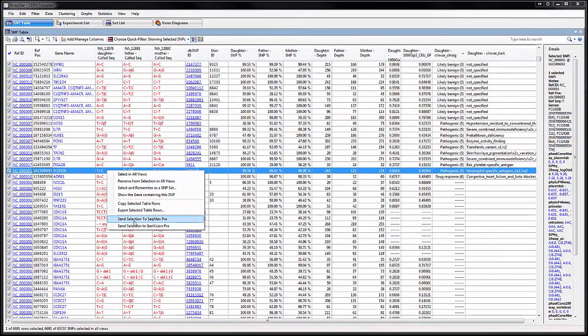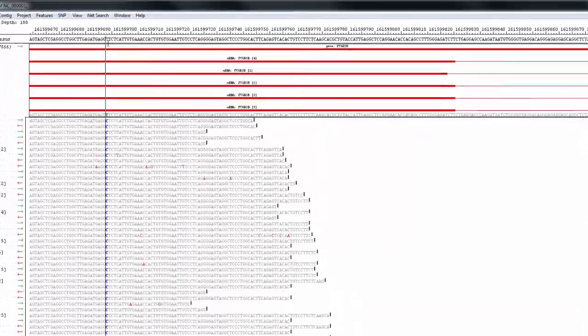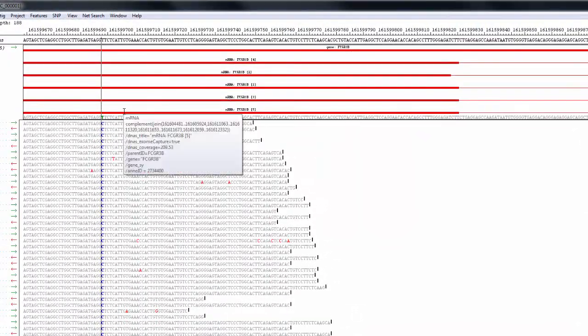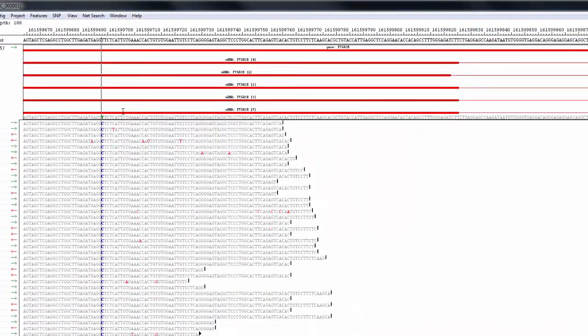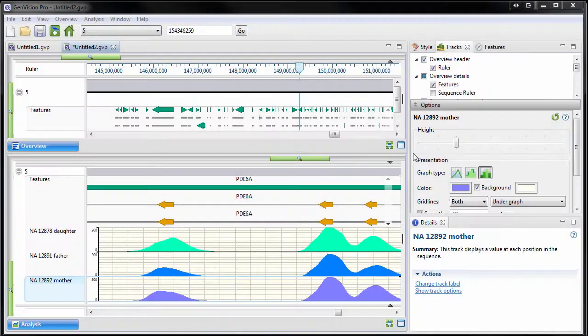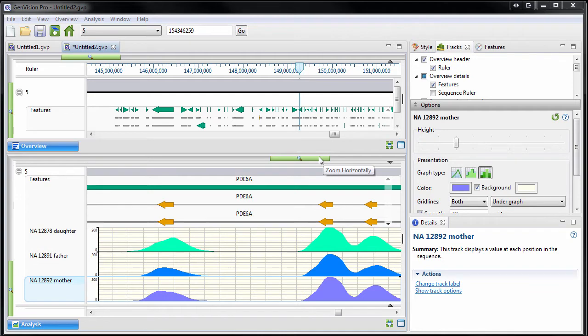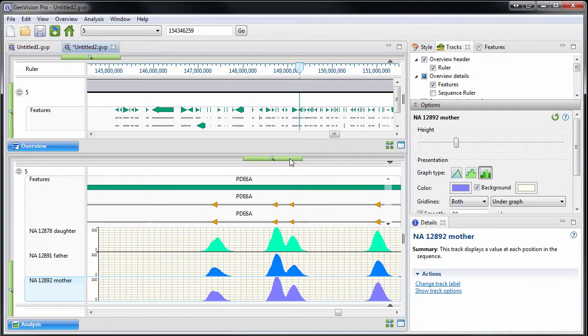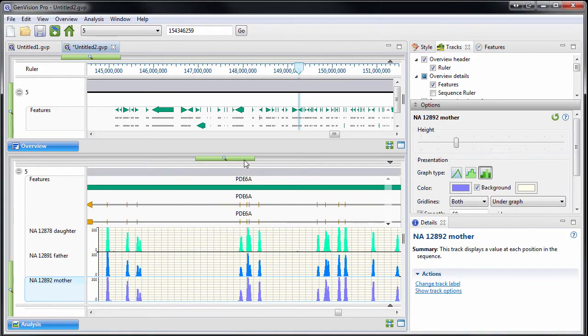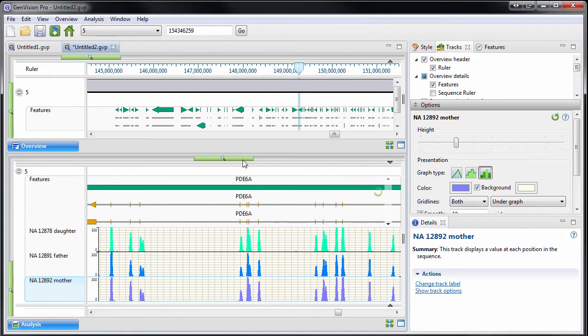The software also includes easy-to-use methods to examine read alignment and variant calls. And with the introduction of GenVision Pro, you can easily view and compare assembly coverage across the genome between multiple samples.